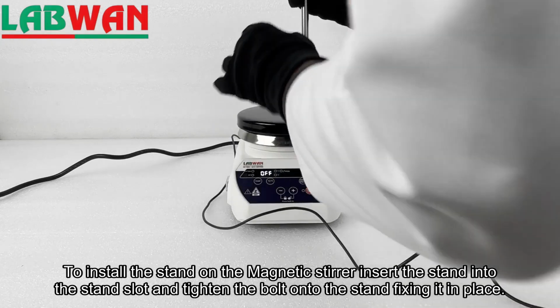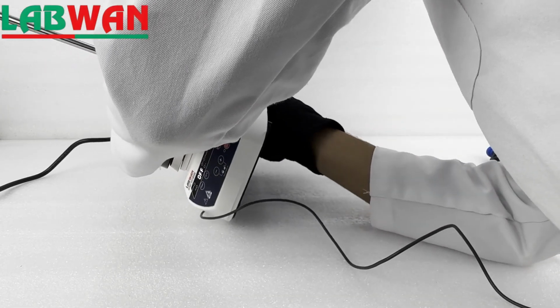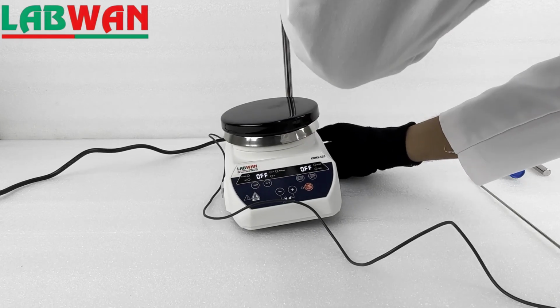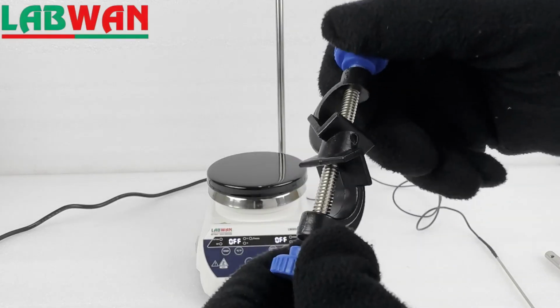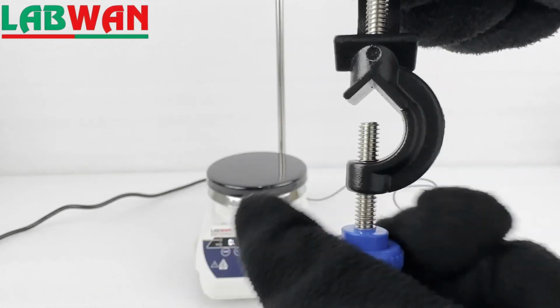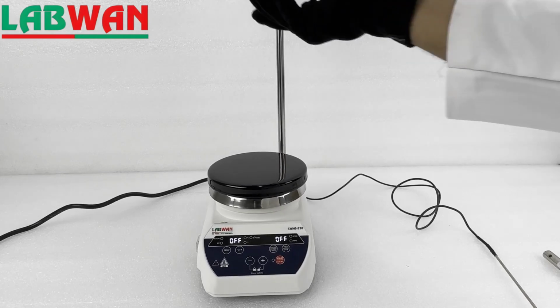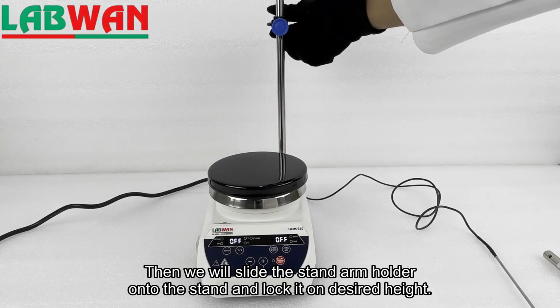To install the stand on the magnetic stirrer, insert the stand into the stand slot and tighten the bolt onto the stand, fixing it in place. Now we will loosen the screw of the stand arm holder on both sides. Then we will slide the stand arm holder onto the stand and lock it on desired height.